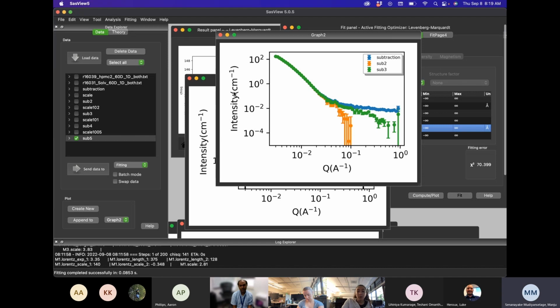Could I add something? Oh, yeah. So I have fitted these kinds of curves. In my experience, for your blue curve, it's very hard to fit with two Lorentzians. Like, a Lorentzian function is falling down, right? If it is slightly going up, then you can capture it with two Lorentzians. But for your blue curve, I think it's very hard because you have clearly two slopes. So if you want to capture it, you have to have a different function other than the Lorentzian on top of one Lorentzian. That's my experience.